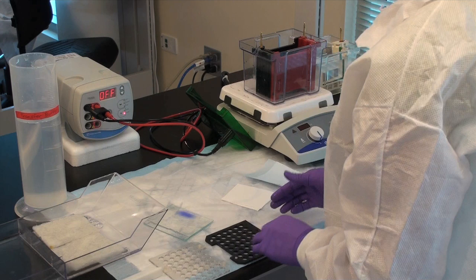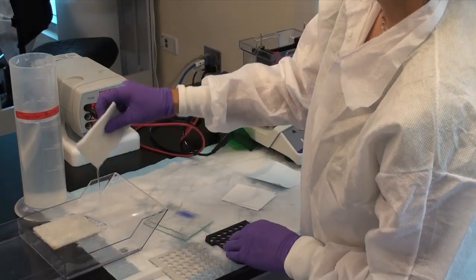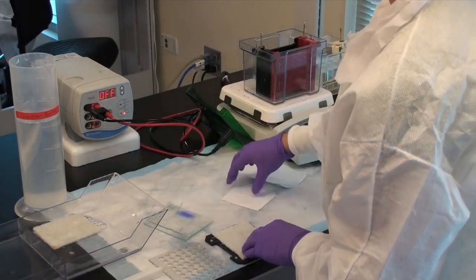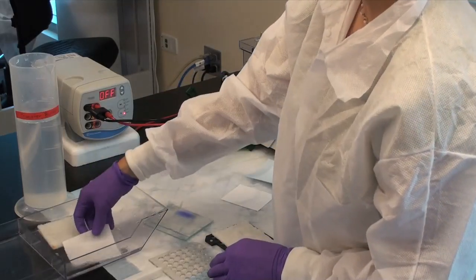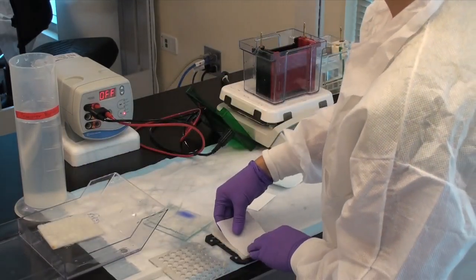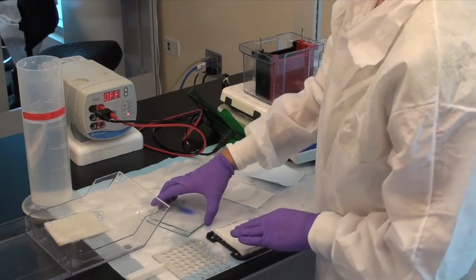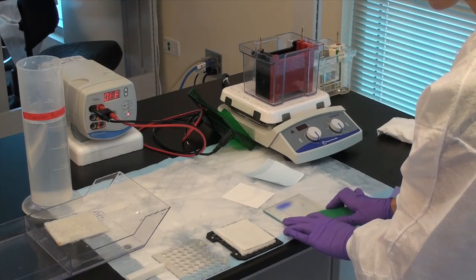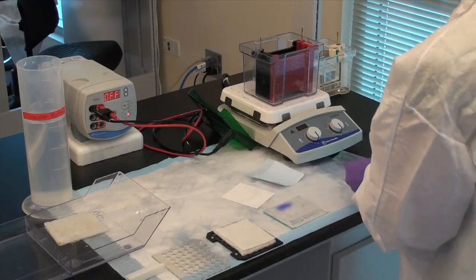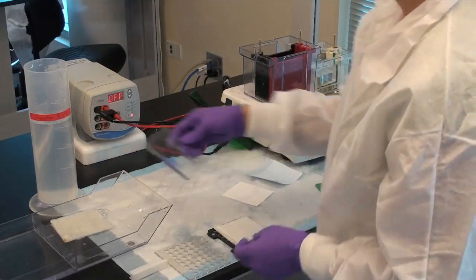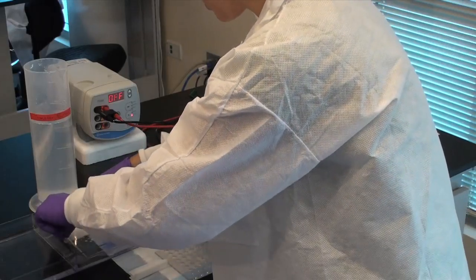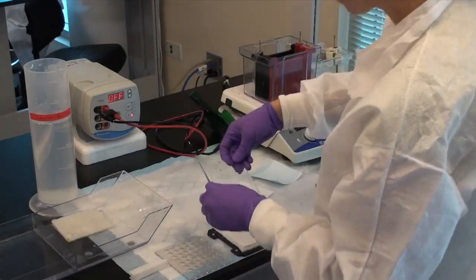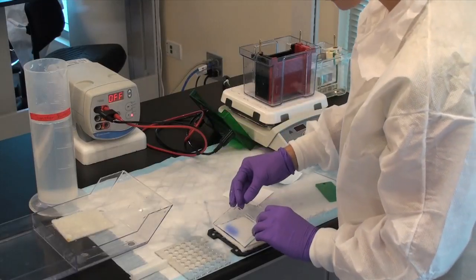Assemble your sandwich in the following order, pre-wetting each component in transfer buffer before its addition with the black half of the sandwich on the bottom. Sponge, filter paper, gel carefully laid out flat.